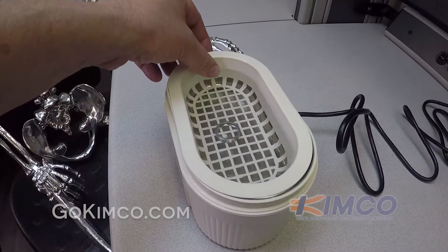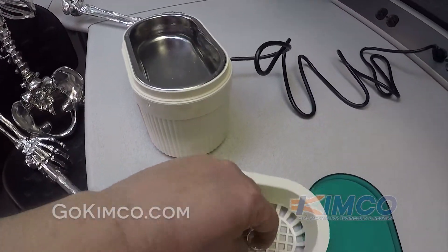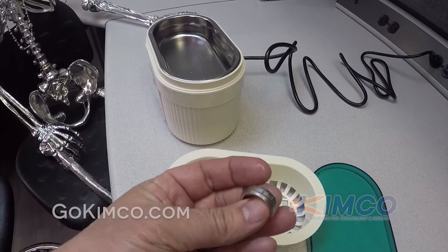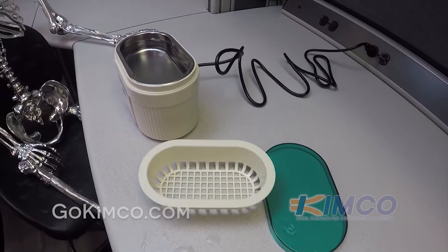So when it's finished, simply remove it, rinse it off, and dry it.